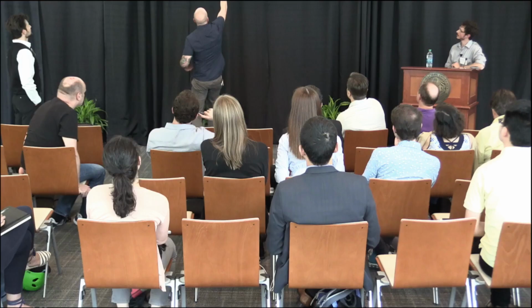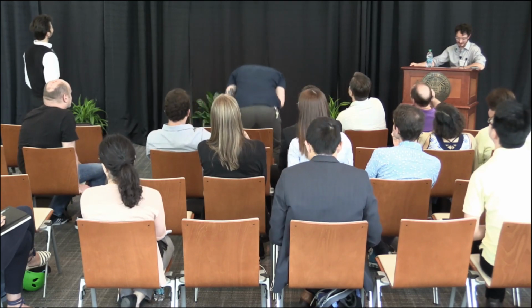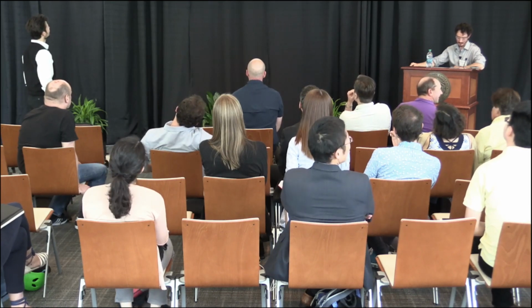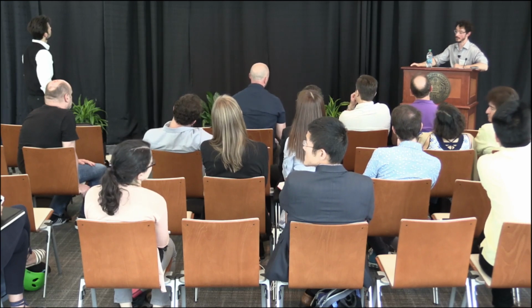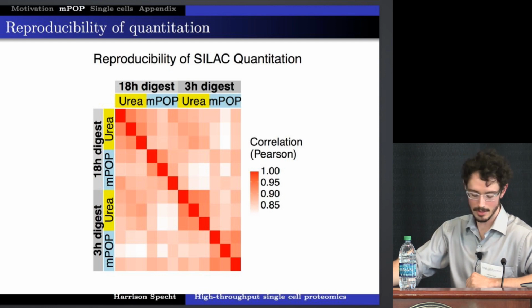So you're saying the 18-hour digests between the 2 different conditions. Oh, are you looking at the replications of the same? It's hard to tell with the colors, but that looks better. Right, and I'm just curious, are you sampling so little that the correlation looks higher? Are there more peptides or proteins in the 18-hour to give you more variance? A similar number of peptides were quantified in both of these samples, around 5,000 to 8,000, depending. But I think they were processed at different times.